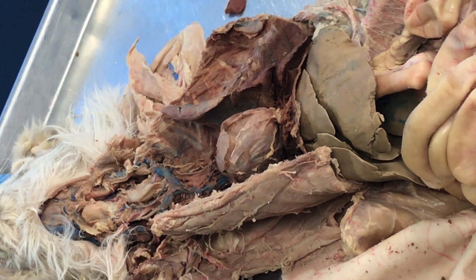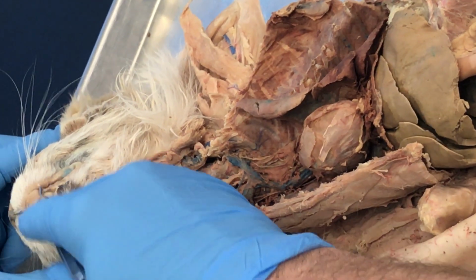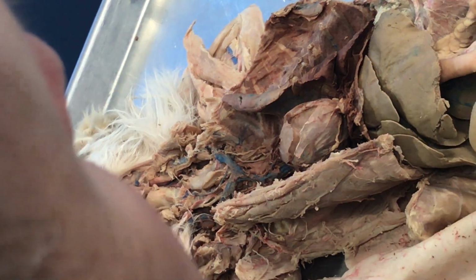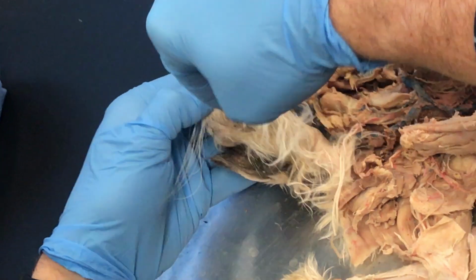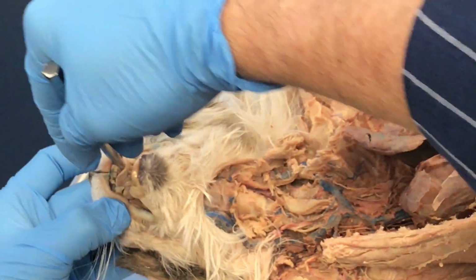Teeth, we know what teeth look like, right? Teeth, that's a tooth. And we have hard palate. Hard palate is this area right there. I did this before with the other group, but if you look in there, you see the ridges on the top of the mouth, Kelly? That's hard palate right there.